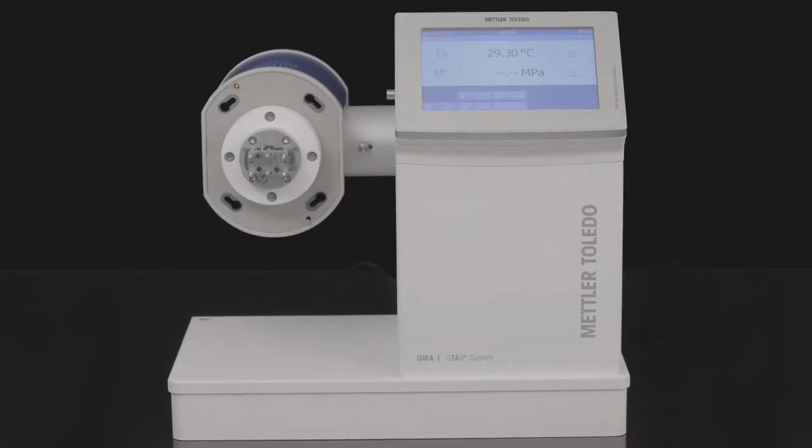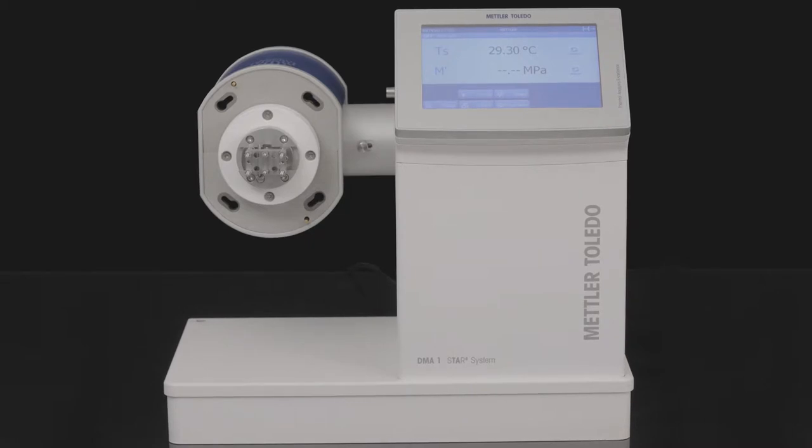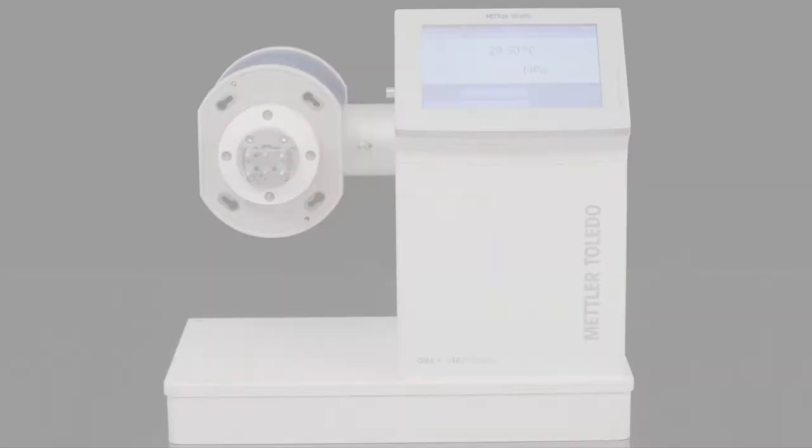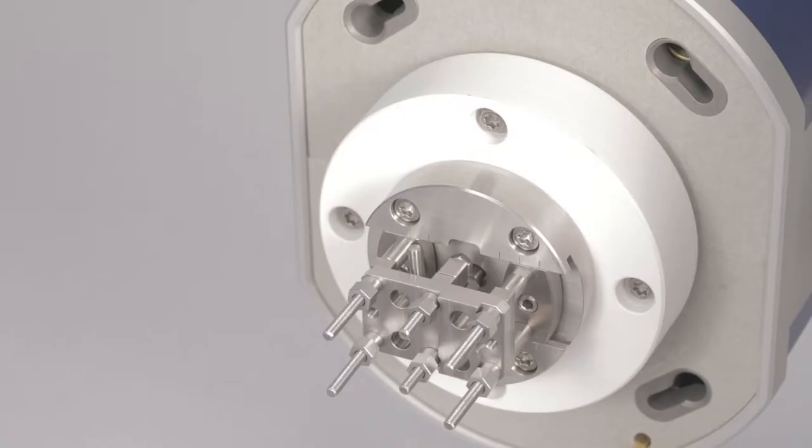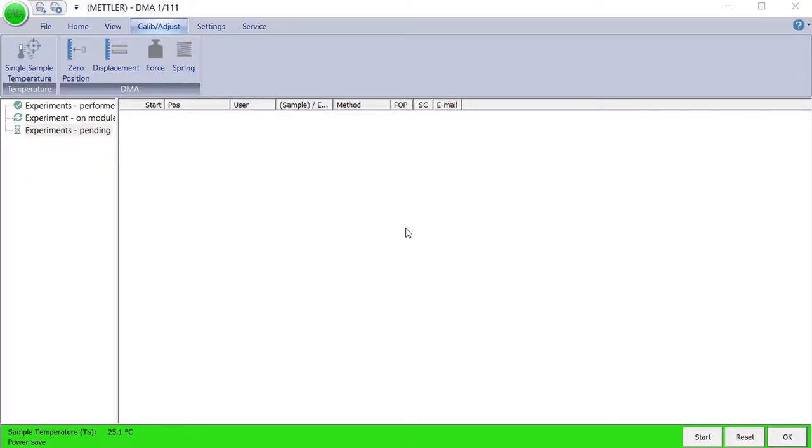DMA1 instrument with the measuring head in the horizontal position. Furnace left open. Bending sample holder installed and with the alignment insert mounted. In the module control window of the STAR-E software, start the adjustment by clicking Displacement Adjustment on the Calibration Adjust menu.